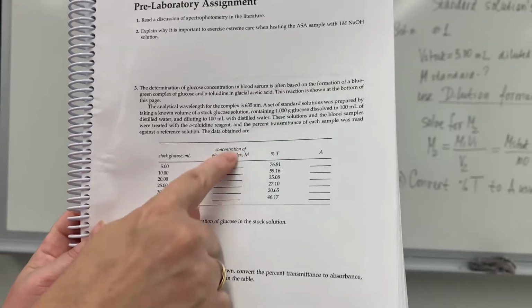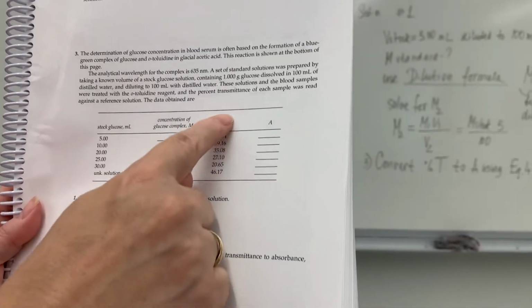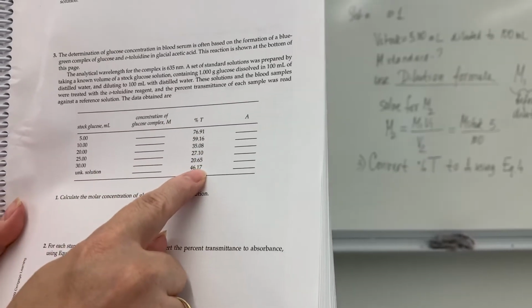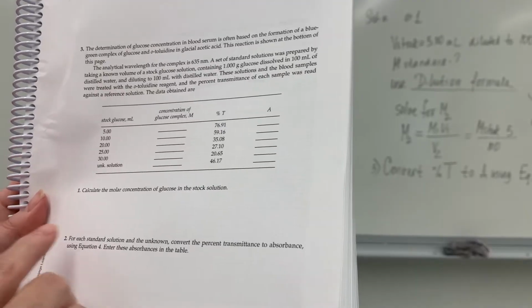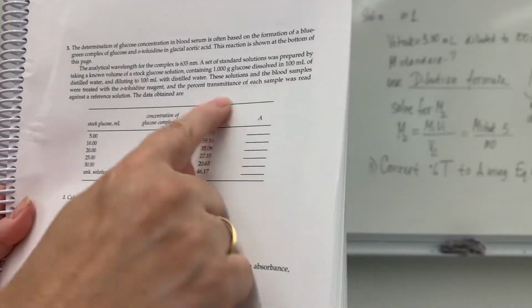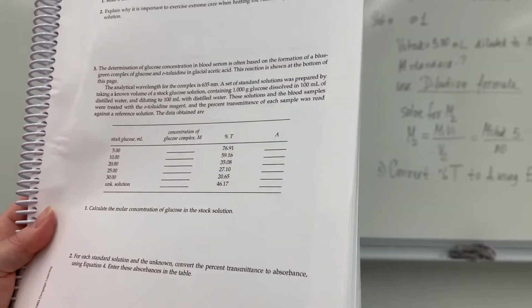Then you have to fill out the second column that says concentration of glucose complex, and what you're given here is percent transmittances. What you're going to do is find equation 4 in the background information and use these percent transmittances to calculate absorbance values for all of these standards.